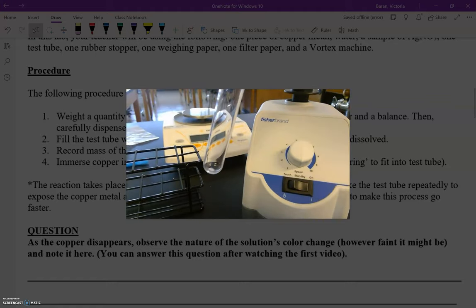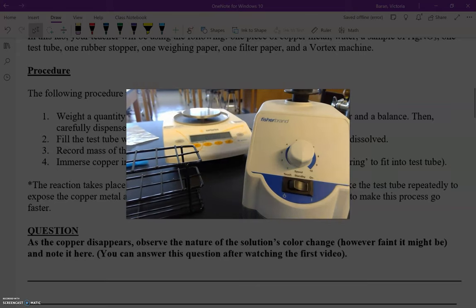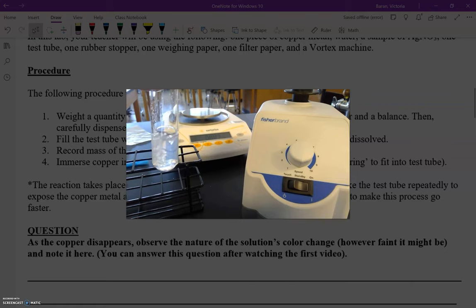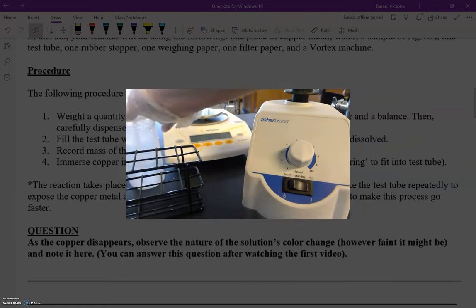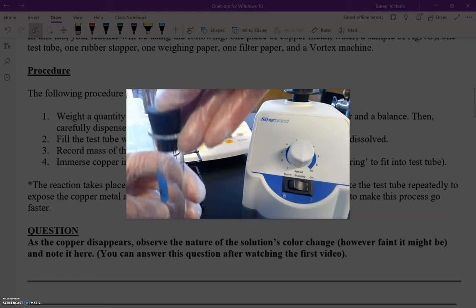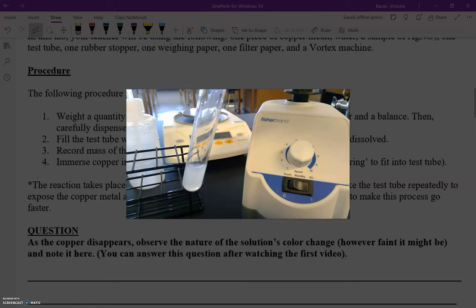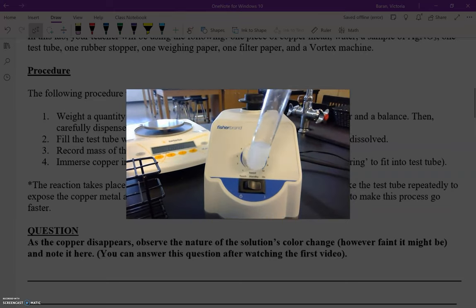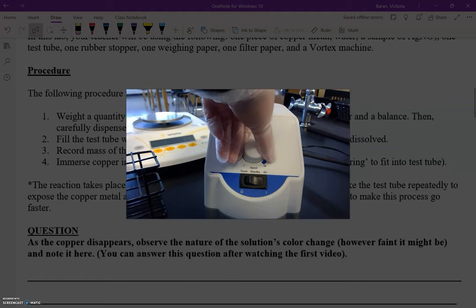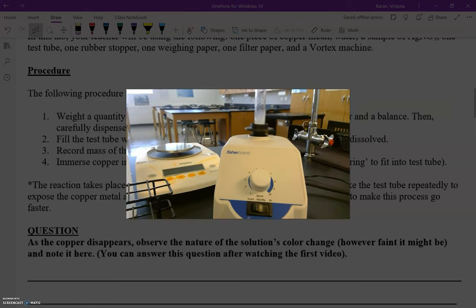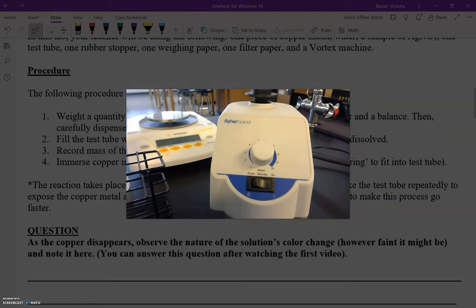I added my silver nitrate very carefully to this test tube — you can see it in the bottom. I'm going to add some water to dissolve it; it doesn't have to be a perfect amount. I'll put a stopper on top and use something a little more fancy — this is called a vortex machine. I'll turn it on to vortex and mix the solution, and keep doing this until the silver nitrate is completely dissolved.